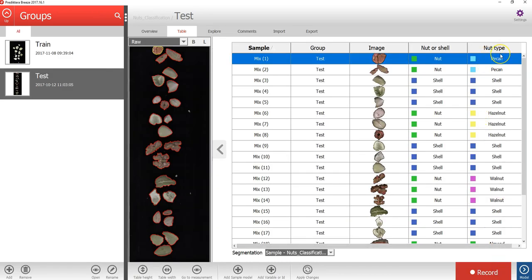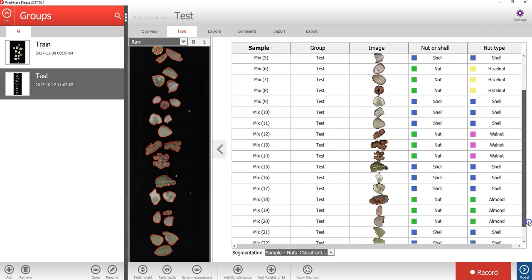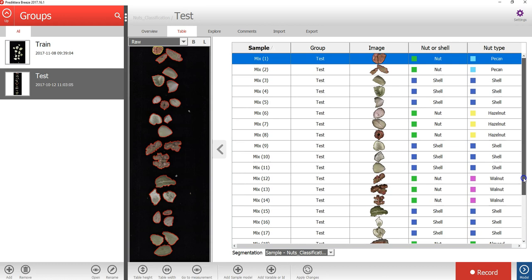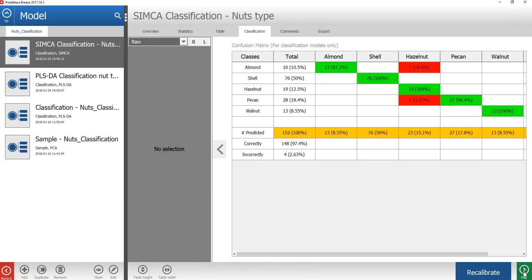This is the nuts classification test sample spreadsheet. As you can see now, we have a column on the right side here that's been added, which shows the nuts type for the test set. Now let's press the model button to go back to the model view.